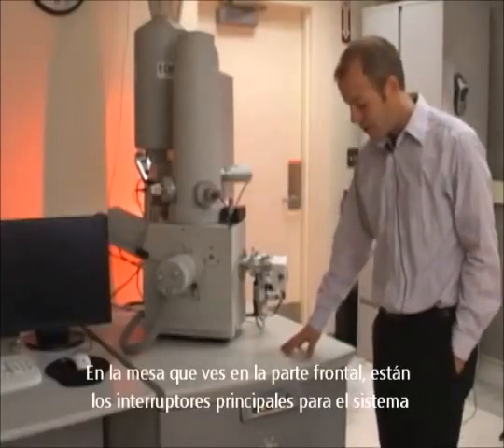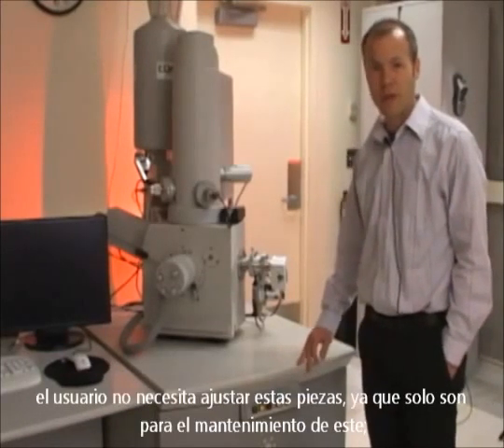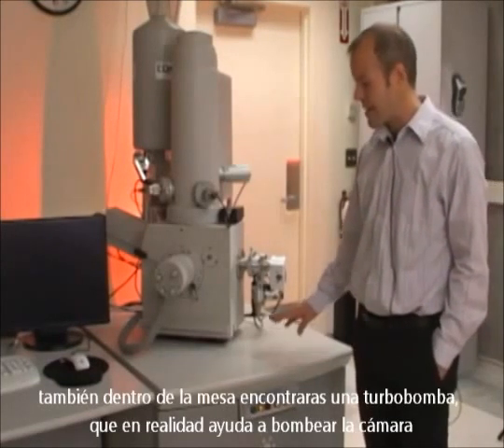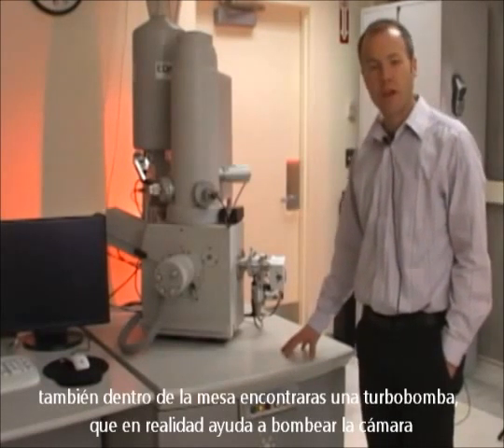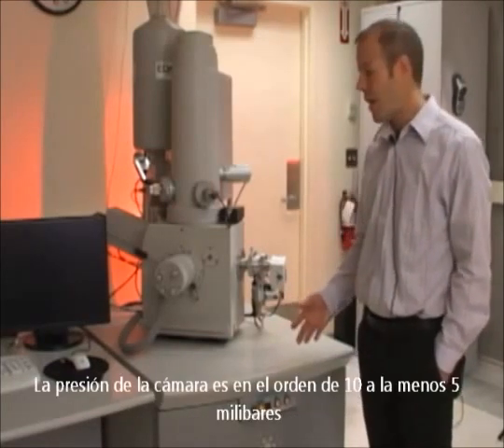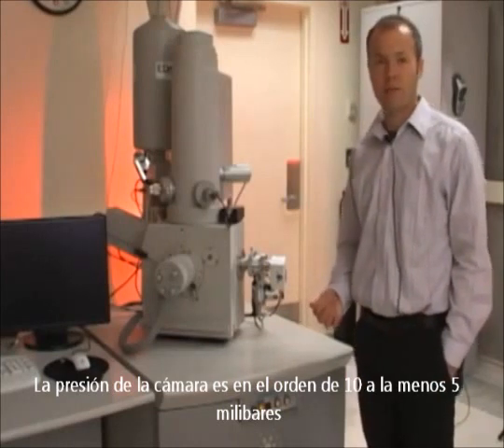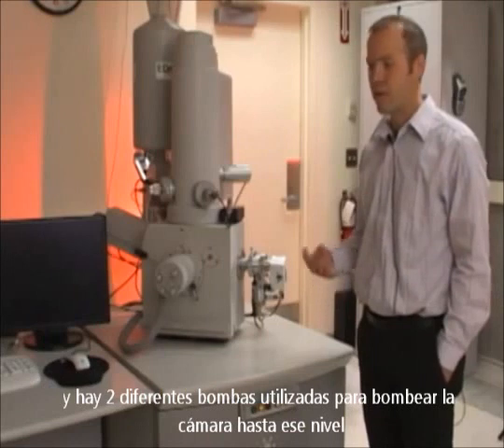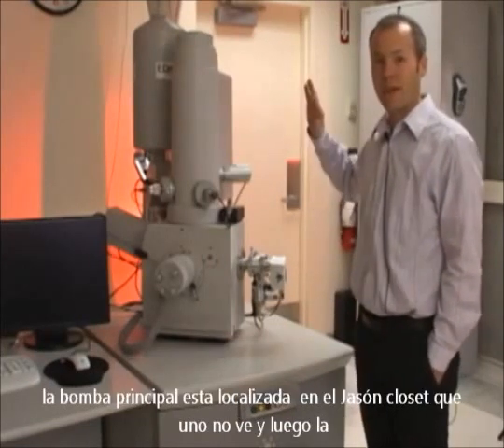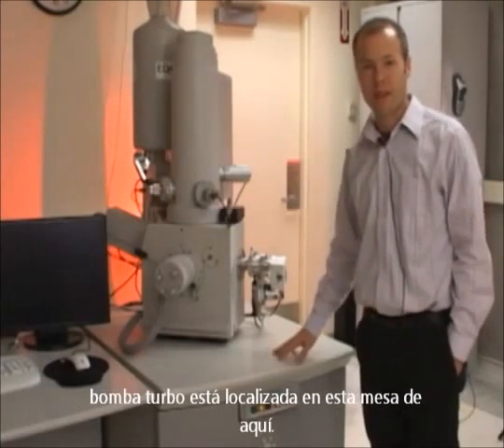In the table you'll see across the front are the main power switches for the system. The user doesn't need to adjust these power switches for any reason — they're only for maintenance purposes. You'll also find inside of the table there's a turbo pump that actually helps pump the chamber down to high vacuum. The chamber pressure is on the order of 10 to the minus 5 millibar. There are two different pumps used to pump the chamber down to that level. The main pump is located in the adjacent closet, and the turbo pump is in this table here.